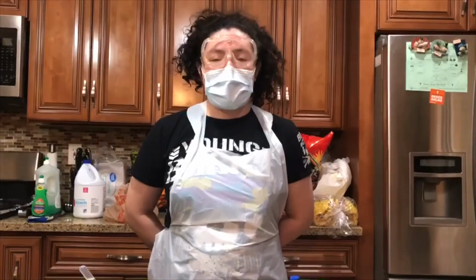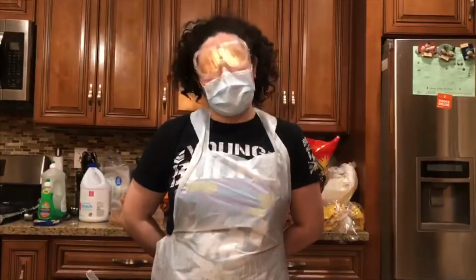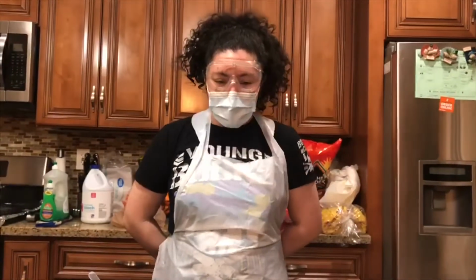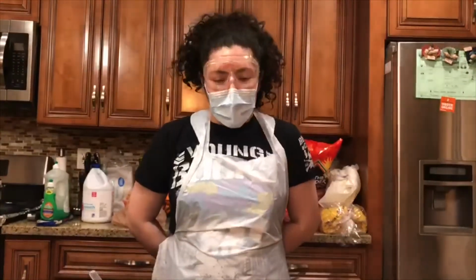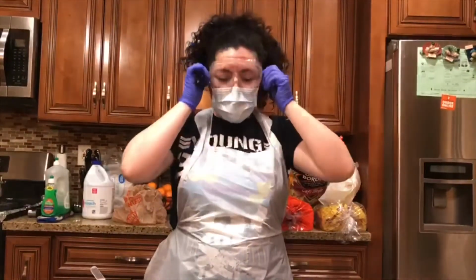My name is Kelly Madrid. Today's date is December 14th, 2019, and this is week 7 lab video exercise 1, the Kirby Bauer diffusion testing, and we're doing part 1, so it's the preparation for the Kirby Bauer diffusion testing.